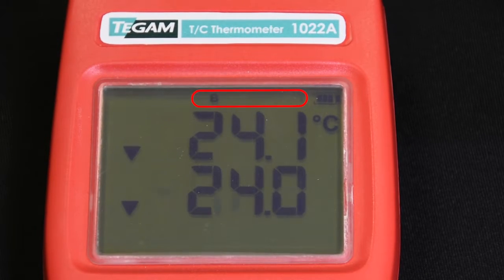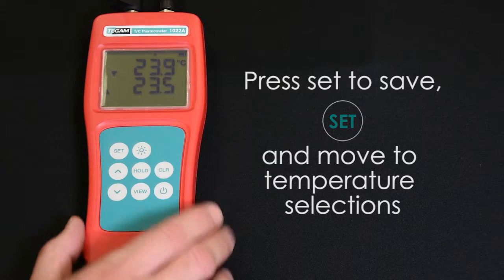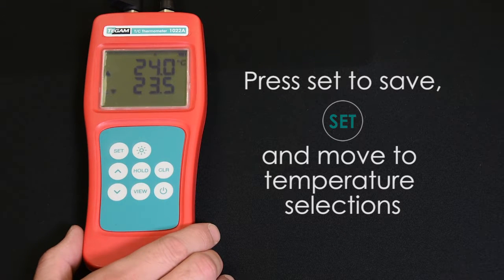To save your selected thermocouple type, momentarily press the set key to save that setting and move to the temperature units.